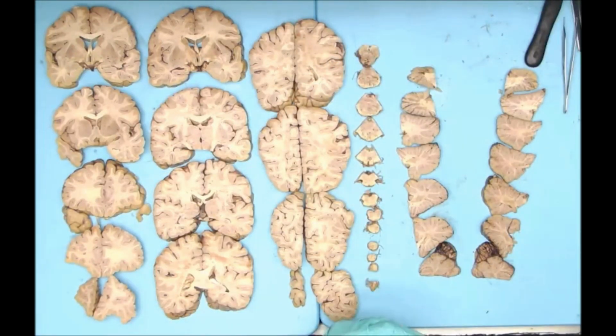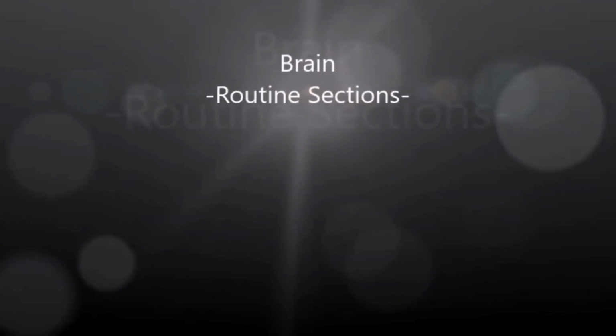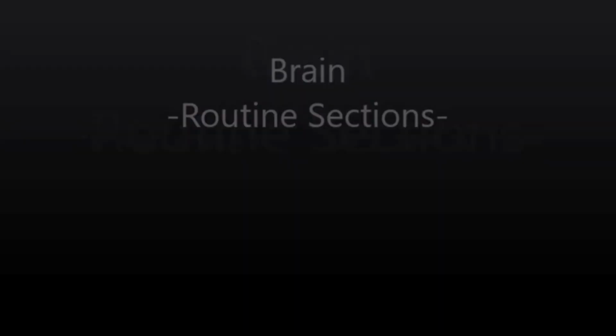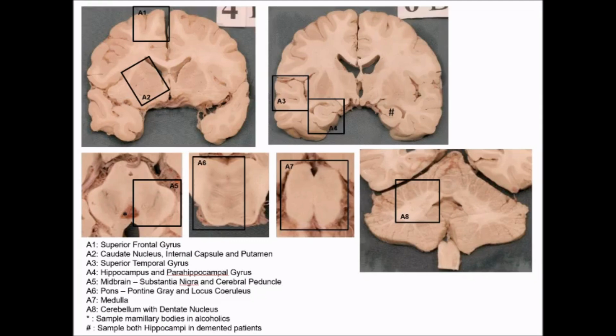There you have it. Now, if there's no pathology, we just take these usual, routine sections from one half of the brain here. There's no pathology.